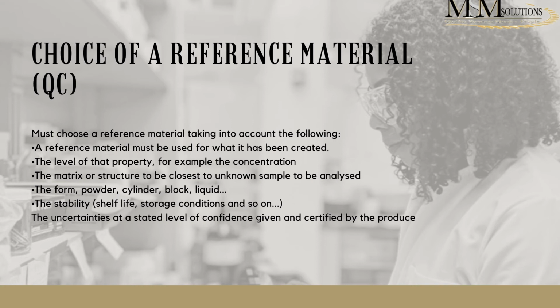What you look at in terms of your reference material is also the uncertainty at a stated confidence limit given and certified by the producer. So most of the time when you buy these quality materials, they would have a concentration level attached to it, and there will also be a stated uncertainty associated with that concentration.